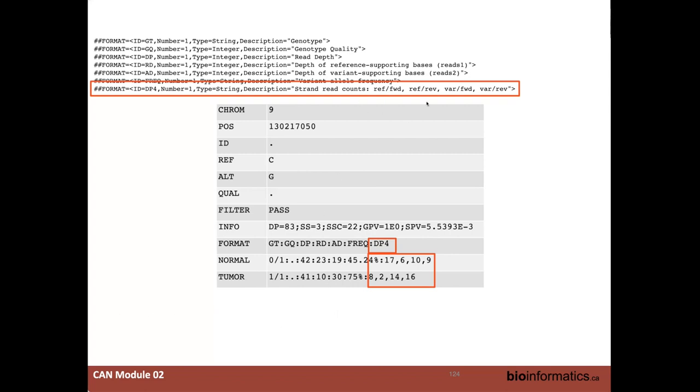Can I ask a separate quick question? You see normal reference reads in the tumor sample, but it's called LOH. So presumably those are just from normal stromal cells in the sample or something, like there's some threshold.